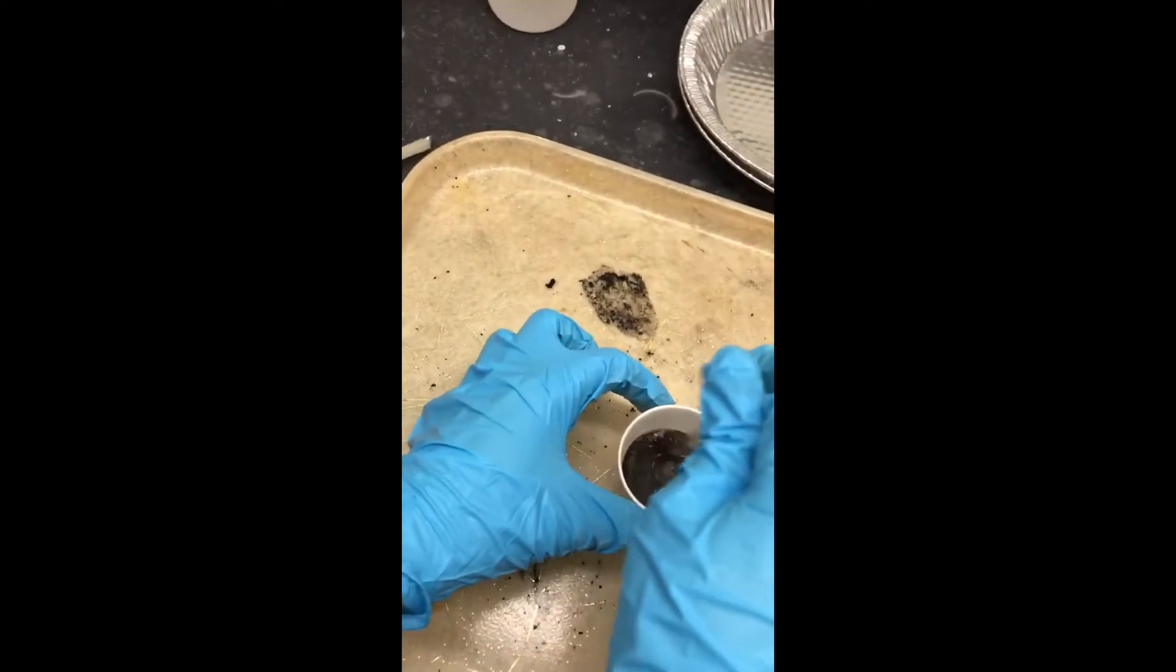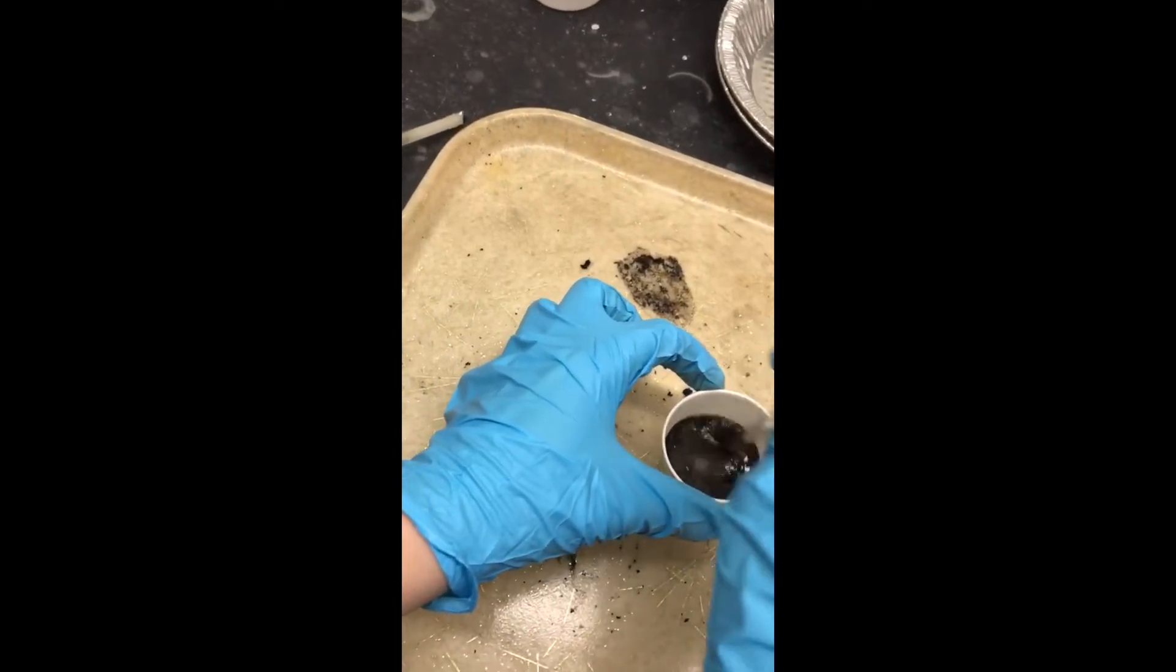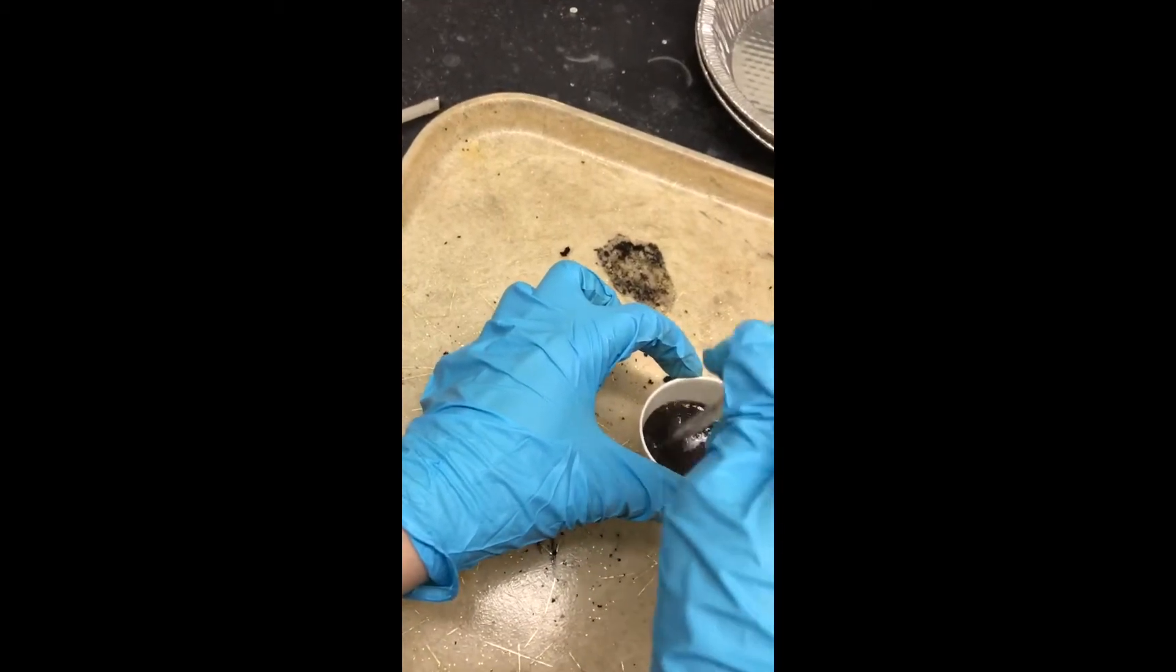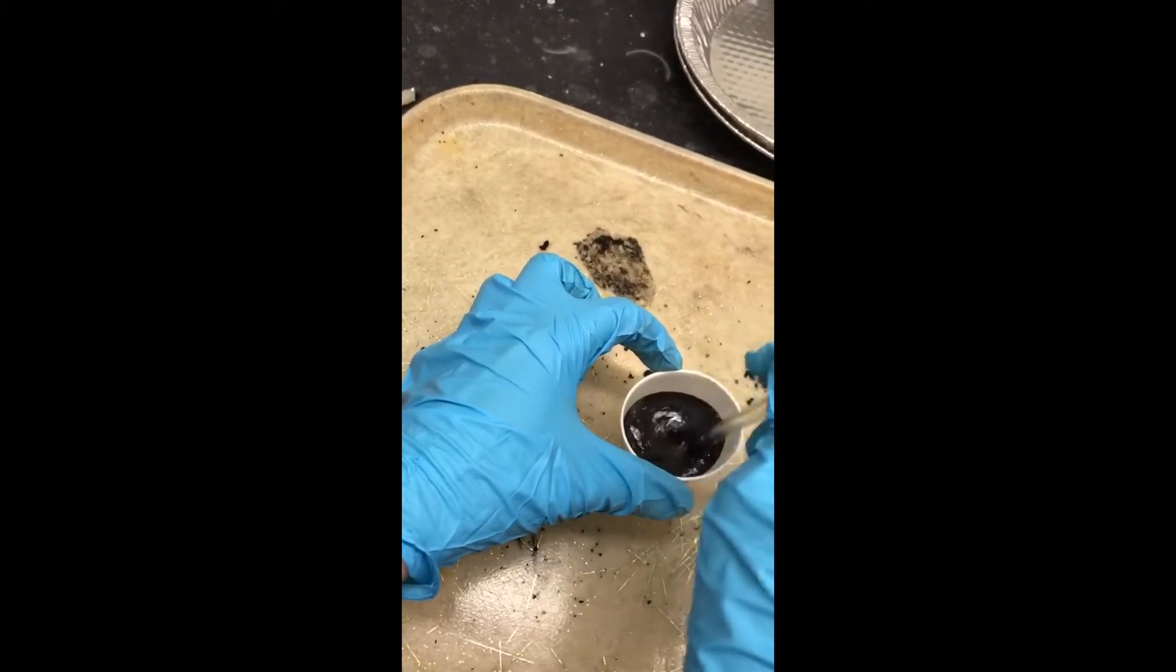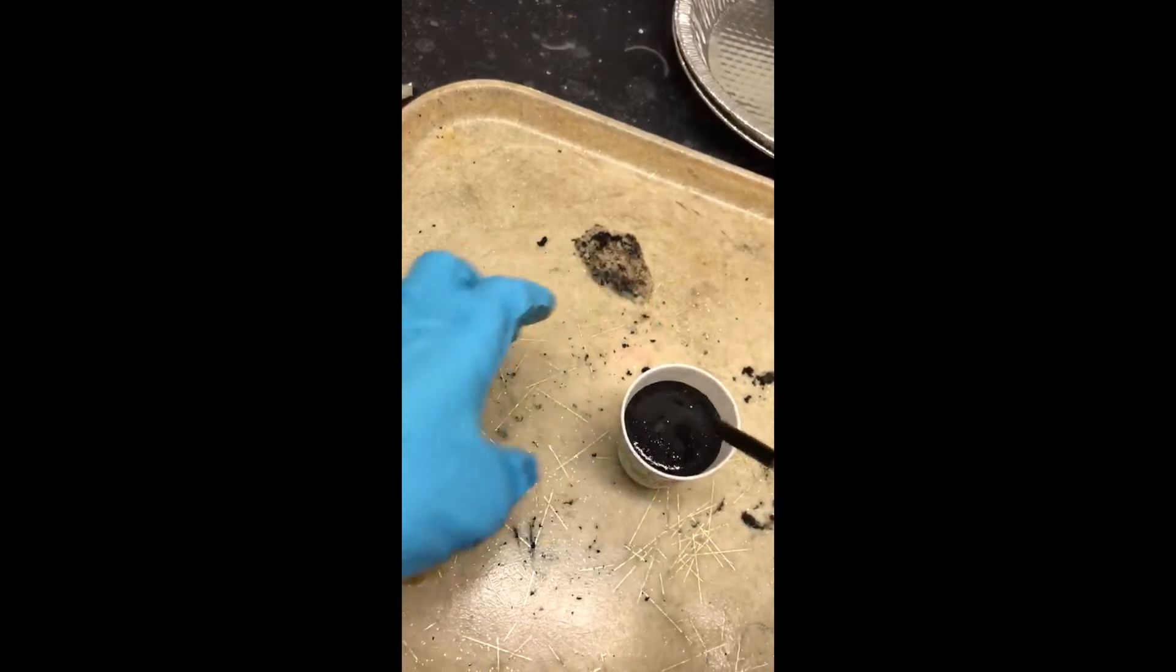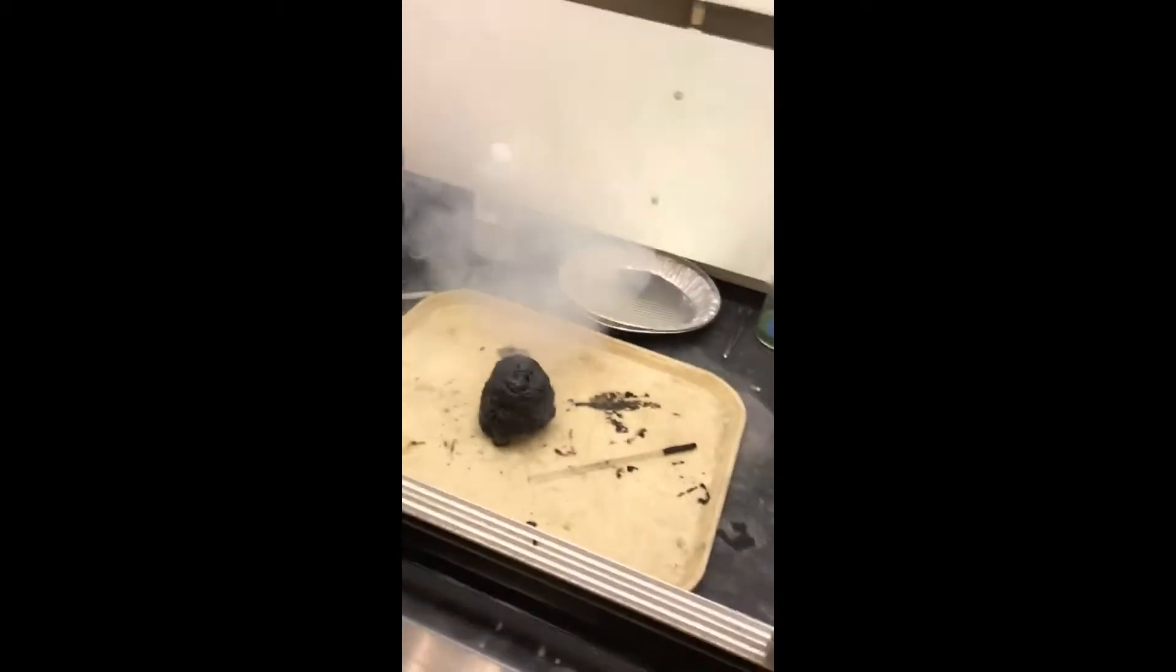In the final step of our experiment, making sure that the fume hood is on, we stir together the sugar and sulfuric acid to start the exothermic reaction. Once the solution starts to elevate, back up in order to avoid breathing in the toxic fumes.